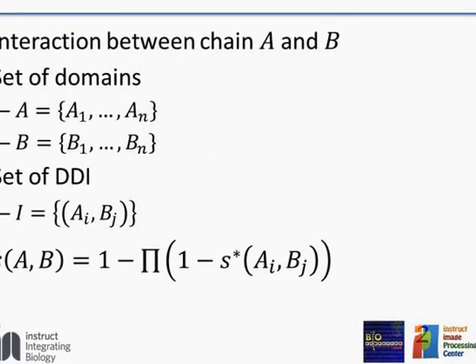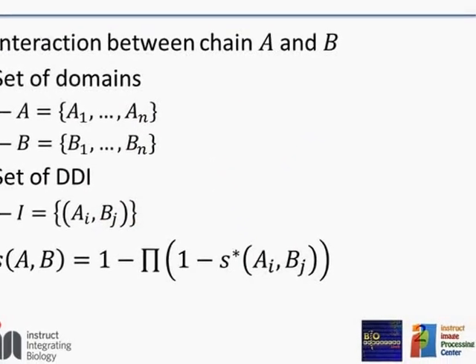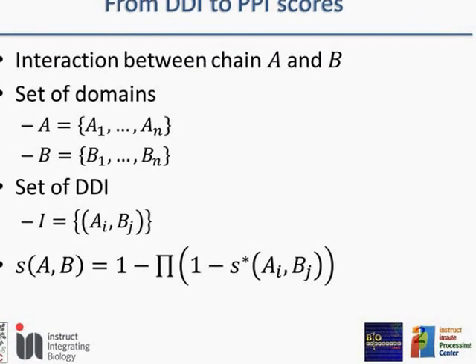And what I want to do is to score these domain-domain interactions.